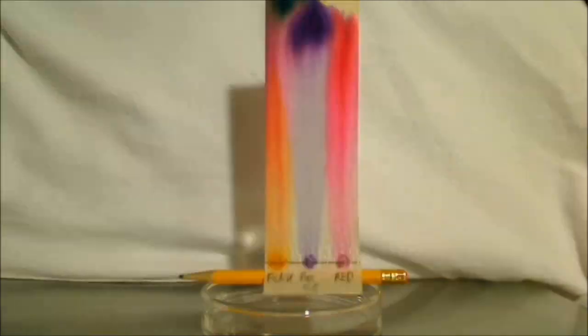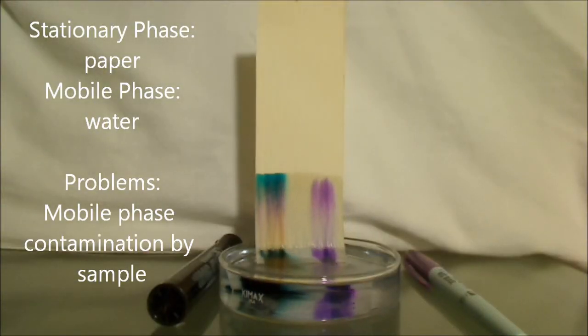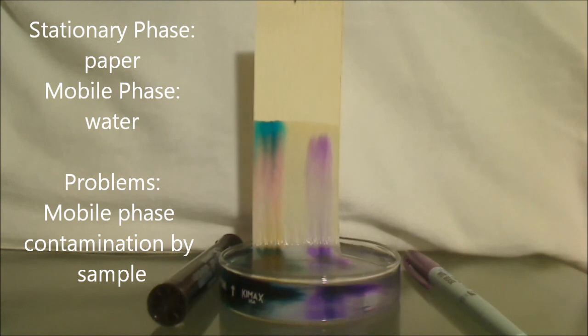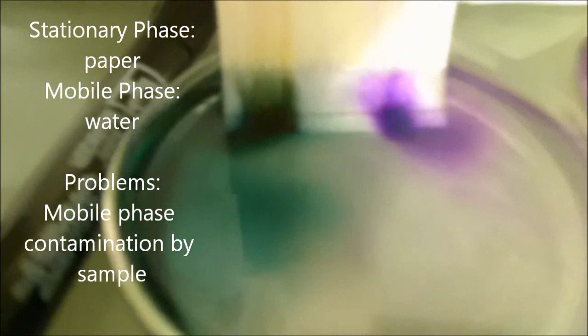Other things that can go wrong is if you put the dots underneath the mobile phase when it's in the container, then the dots will spread out in the mobile phase and contaminate it. So you're not going to get very good results.